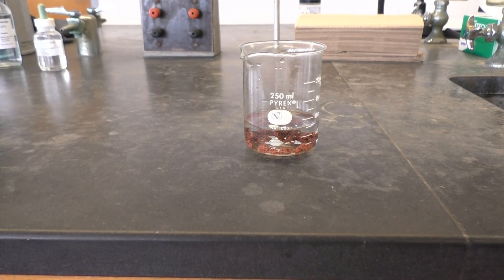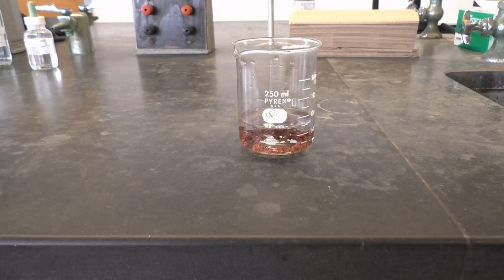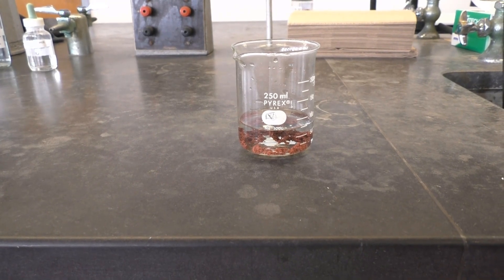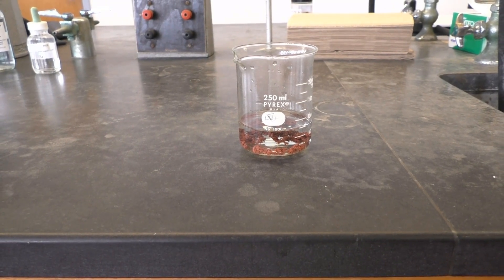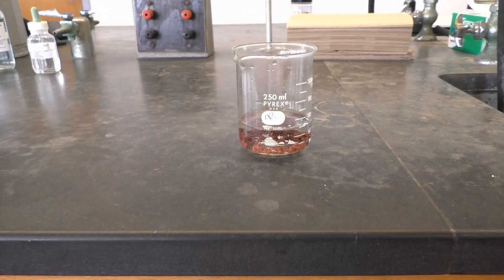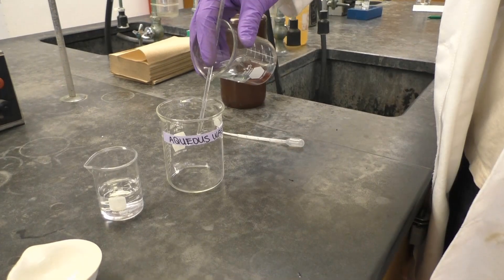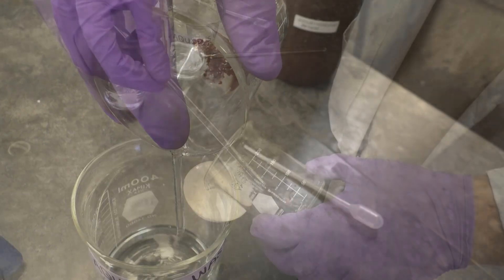Alright! You're finally ready to isolate and dry your final copper product. You'll do this by getting it all into your evaporating dish and then dry it over a steam bath. First, you can decant off the solution from your copper into a waste beaker.